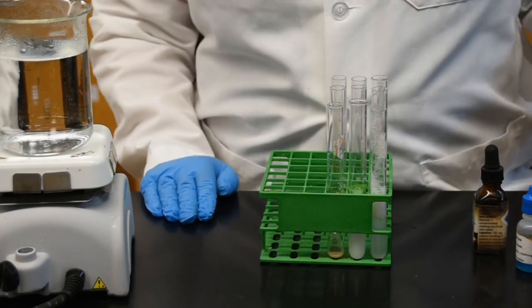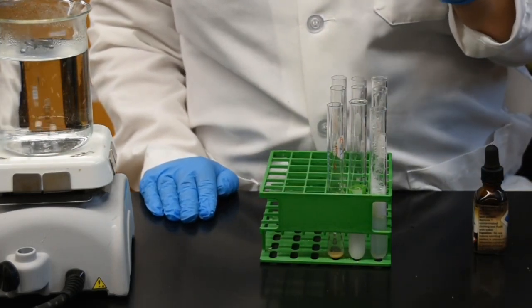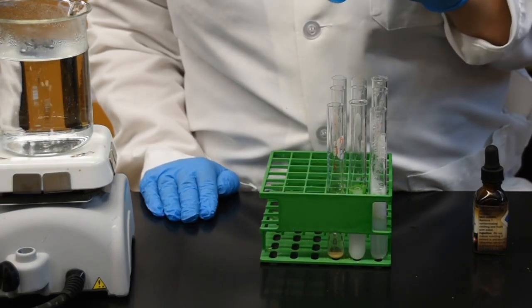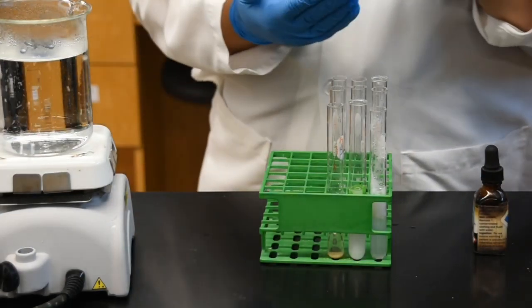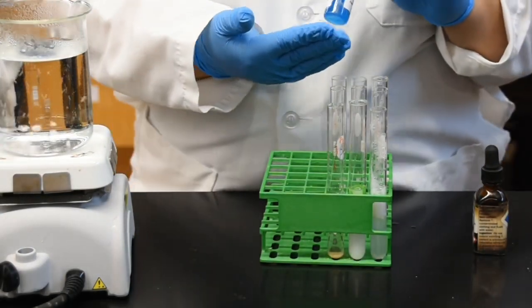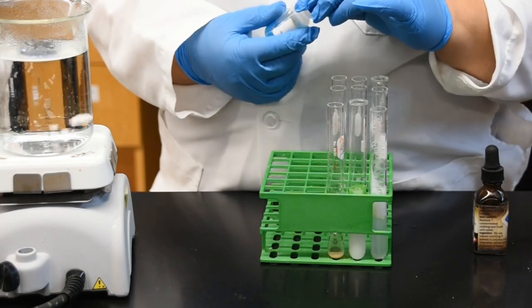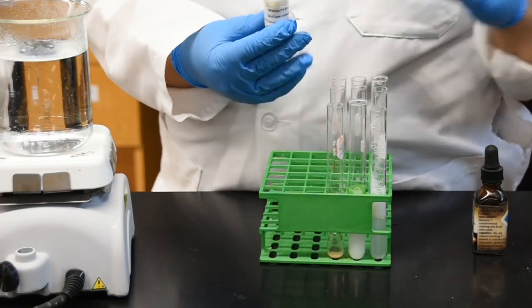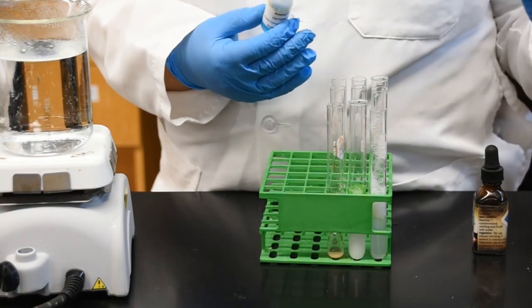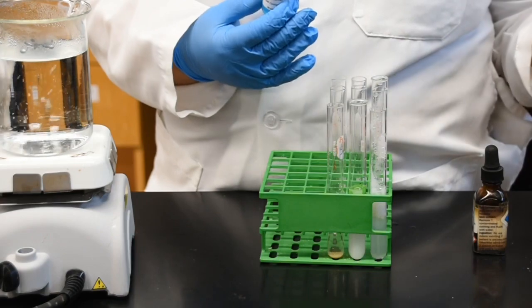Let me give you an example. One of the samples that we have here is Benedict solution, and you can see the color of this indicator is blue. Benedict solution identifies simple sugars when it's heated. If my sample contains simple sugars, then the color will change from blue to a range of yellow, orange, or red, depending on how much sugar we have in the sample.